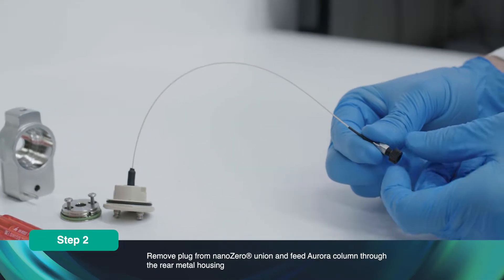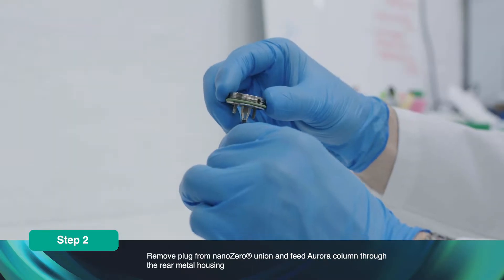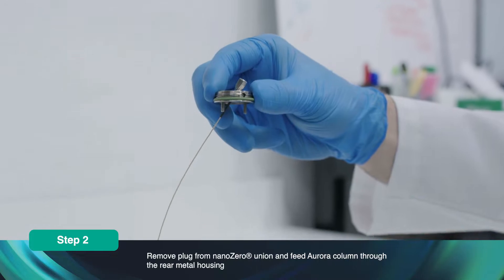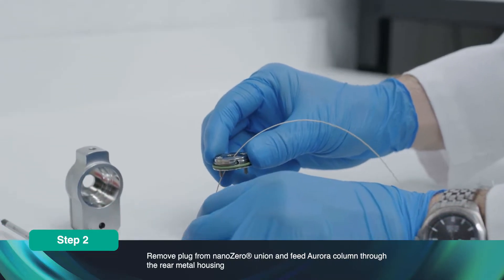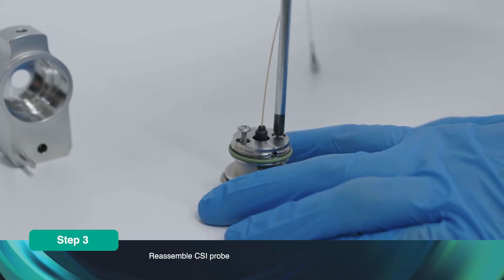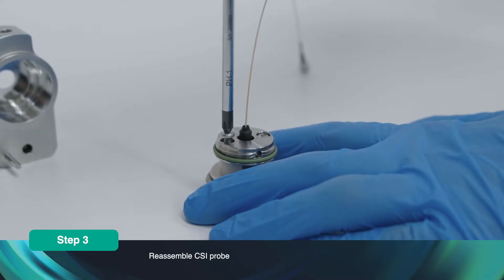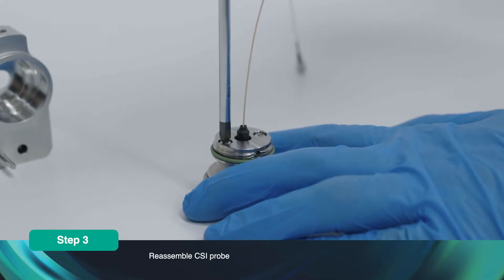Remove the protective plug from the Nano Zero Union. Feed the Aurora column through the rear metal housing. Reassemble the CSI probe by screwing in both screws, ensuring that the rubber seal is in place between the metal housing and the Aurora CSI fitting.